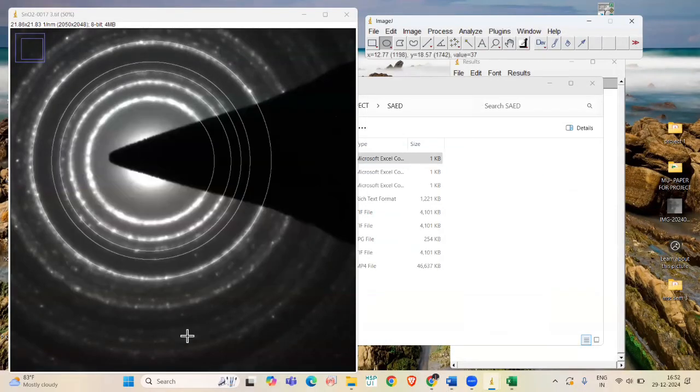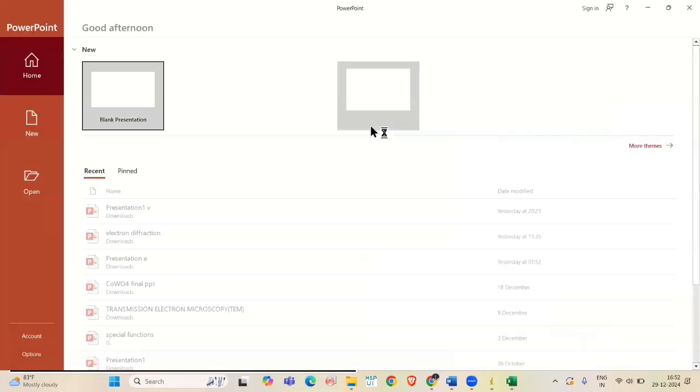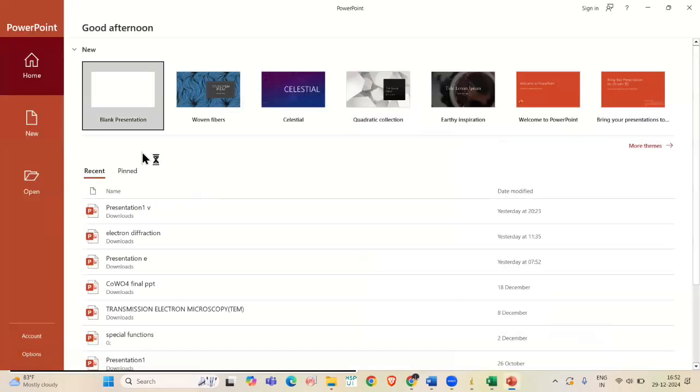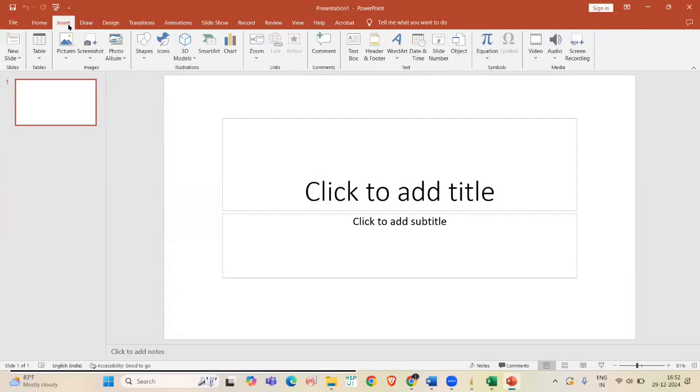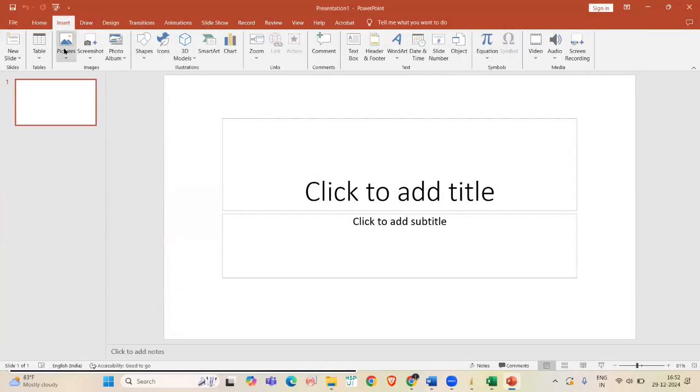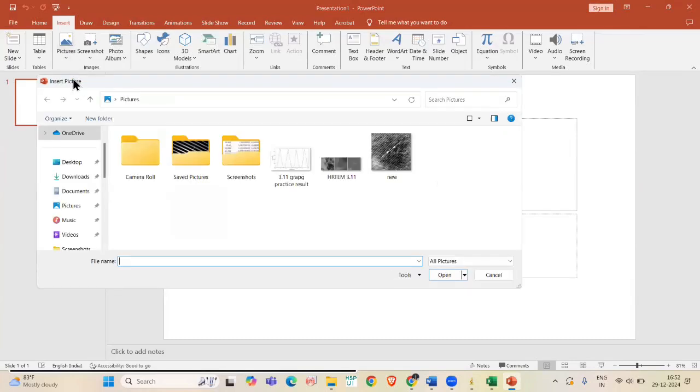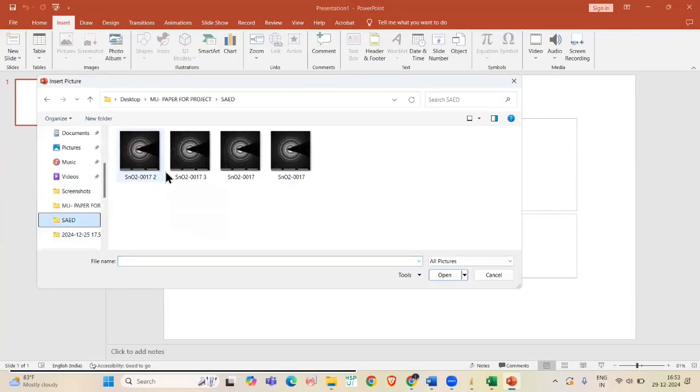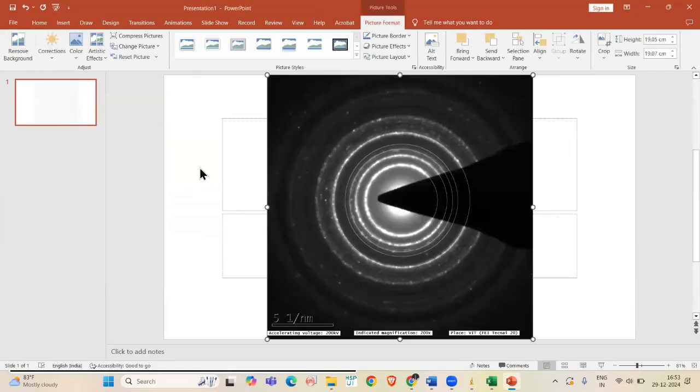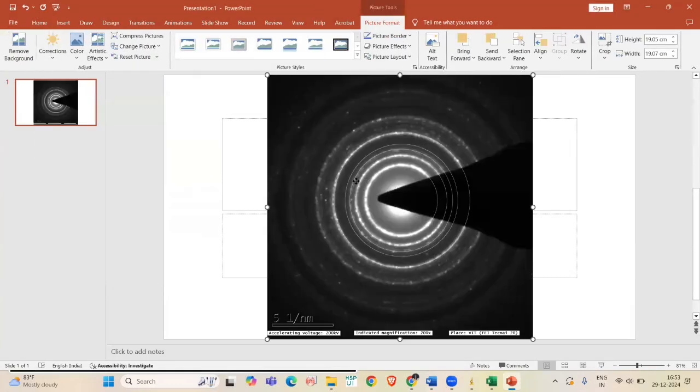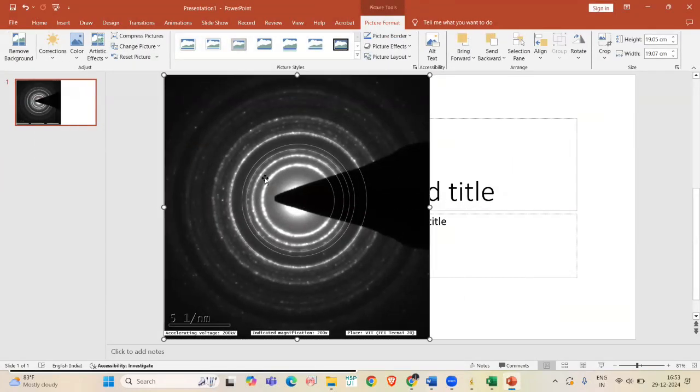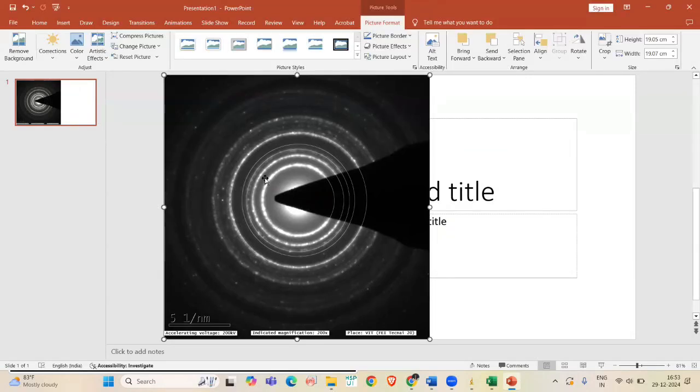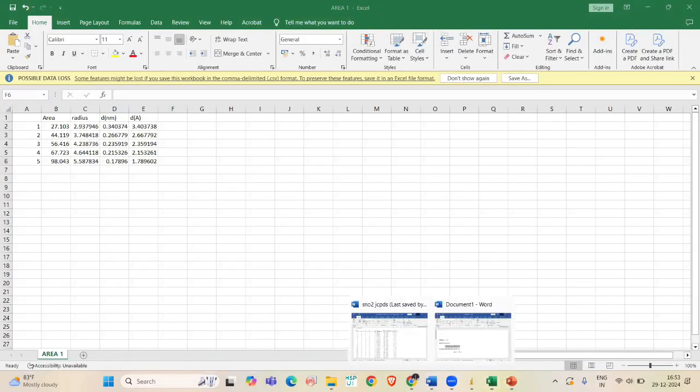Now, open PowerPoint. Insert the saved pattern. Now, label the HKL values based on the calculated D spacing with JCPDS card.